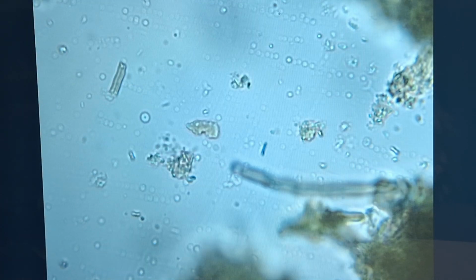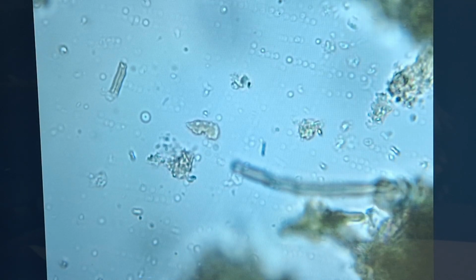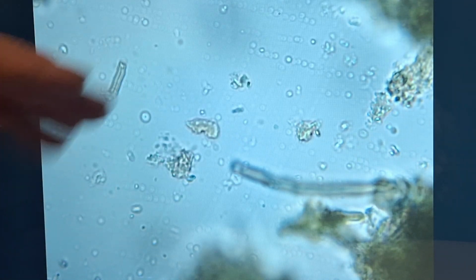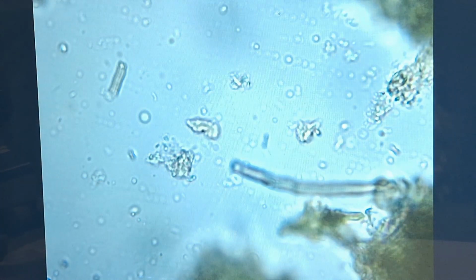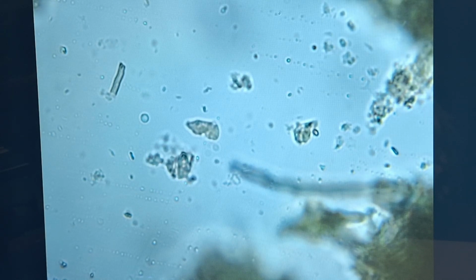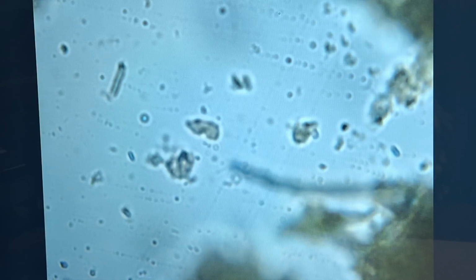All right, we got our sample in. We're zoomed in, not all the way. We're zoomed into 400x. A little bit of a dirty slide, but we can see some nice rod bacteria in here. You see that rod, the way it's moving? So that's a bacilli. And a lot of these dots, different colored dots, those are going to be cocci. So we have some cocci and bacilli bacteria, a nice amount of them.